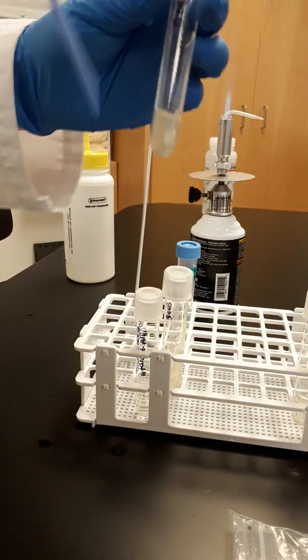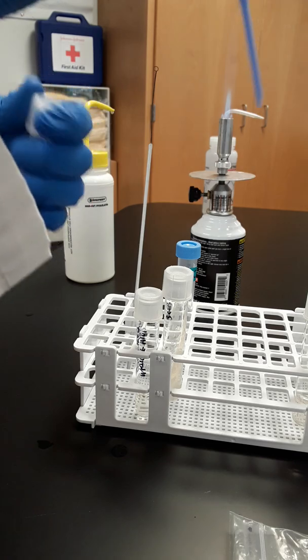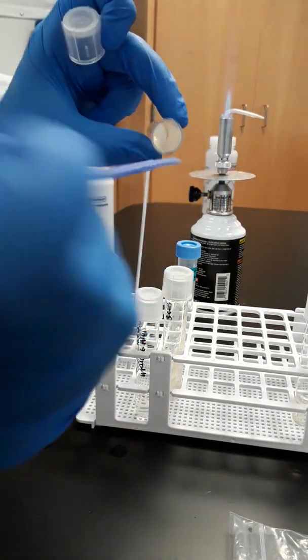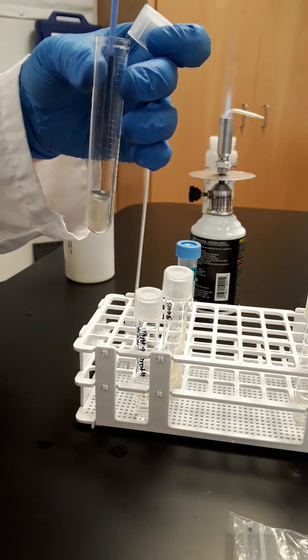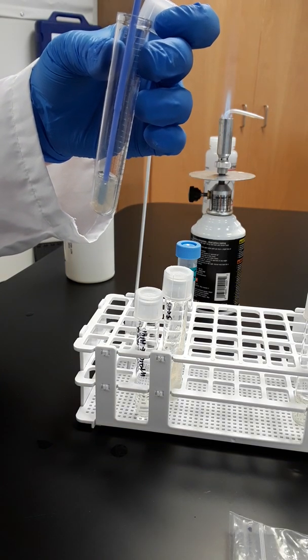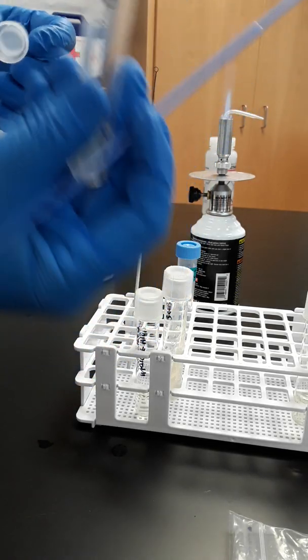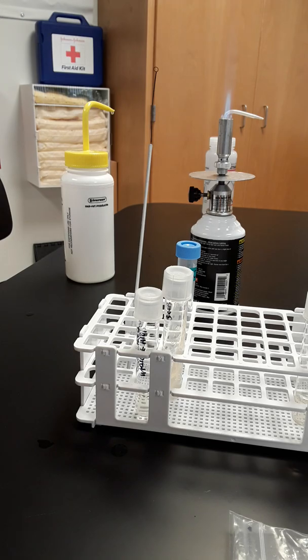And then for the deep tubes, which are deep agar, if you tried to put this on the loop, it would bend and you would not get a straight line. So you want to take this and go as straight into there as humanly possible, not touching the sides, going straight down. You want to take your time and push it straight down all the way. And then pull it straight back up. This will not bend. It will be totally fine. Flame, flame, flame, flame. Did I flame that beforehand? I don't know. Okay.